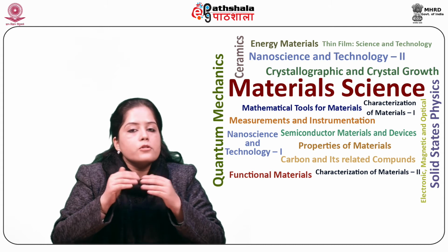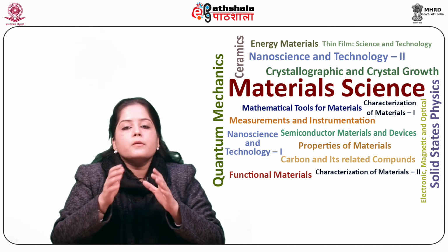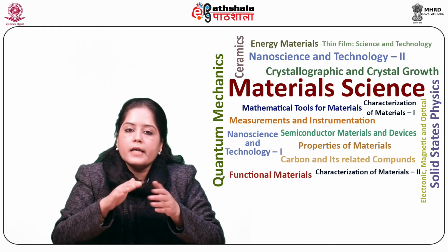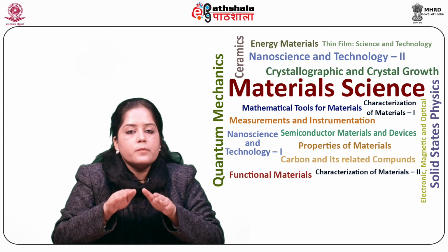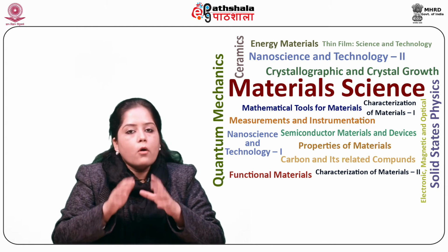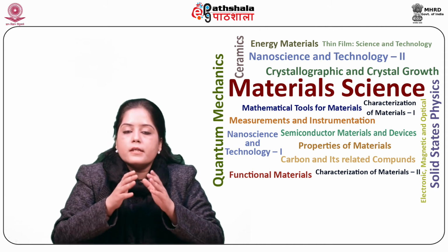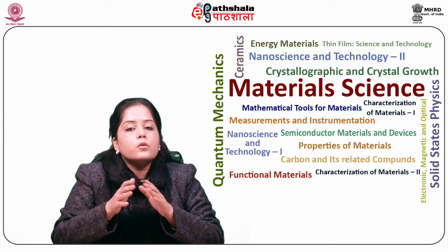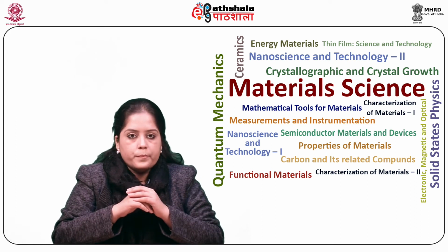Static mode can also be operated in constant height mode, where the probe maintains a fixed height above the sample. There is no force feedback in this mode. Constant height mode is typically used in atomic resolution AFM, though it is uncommon for other AFM applications.